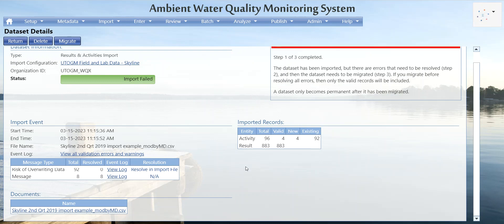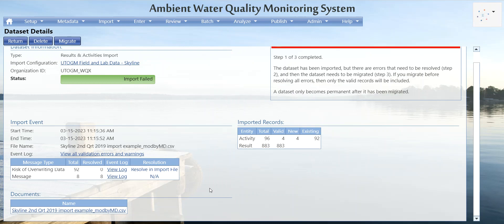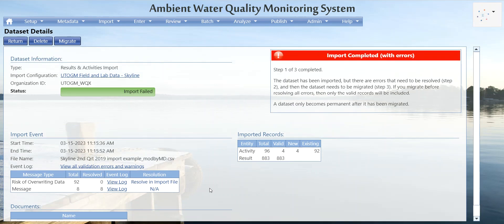This section shows your imported records: total activities, total results, the amount that are valid, the amount that are new, and the amount that are existing. If you had errors — like required value missing or domain value invalid — those would appear here and can often be resolved right in Aquums.